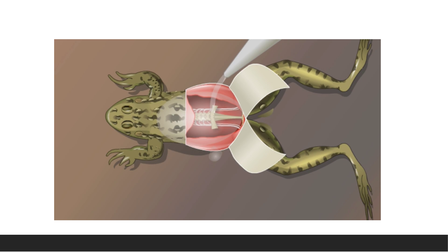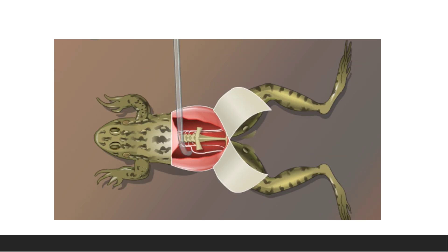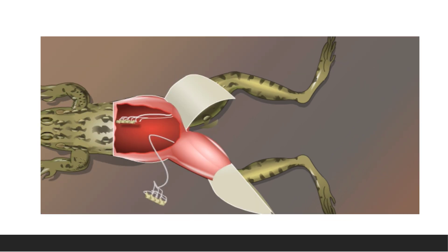Cut the lower end of the urostyle using scissors, and using the bone cutter cut the upper end of the urostyle. Cut the vertebral column two centimeters above the sciatic plexus. In this way, cut the lower and upper ends and separate them. Then bisect the vertebral column.